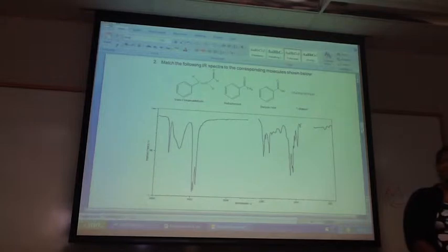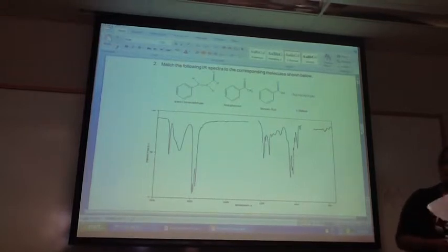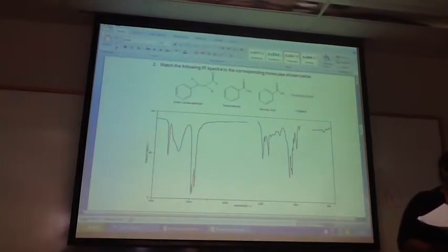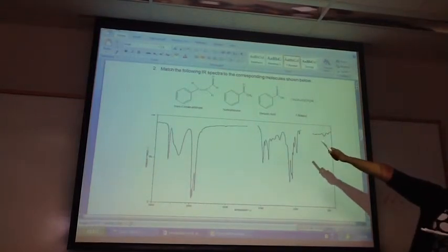It's something you can identify as a functional group, but it's going to be hard to identify on your IR spectrum, so don't worry about trying to find where the aromatic is. And what else is in there? A carbon double bond. Double bond, right? Yeah, alkene. So the functional groups in the first one are an aldehyde, an alkene, and the aromatic.